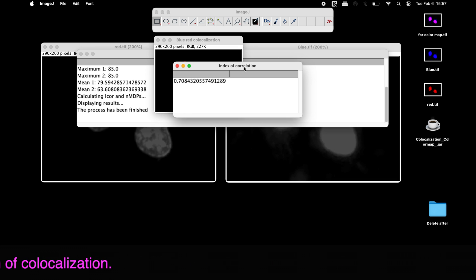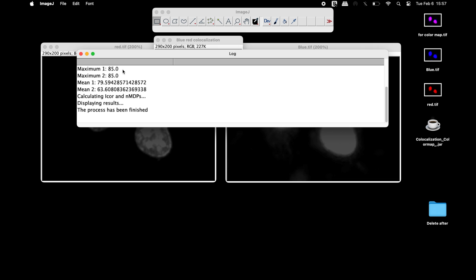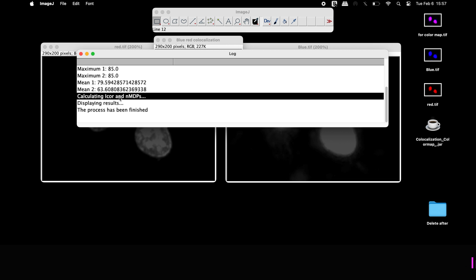The results window displays the index of correlation to be 0.7. Other information can also be found in the log window.